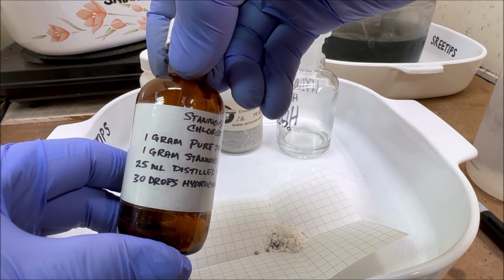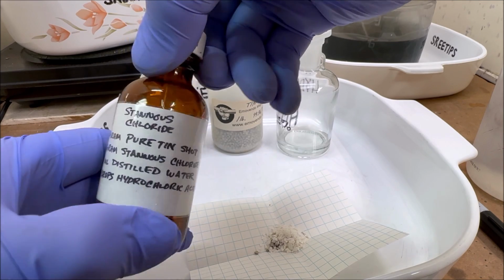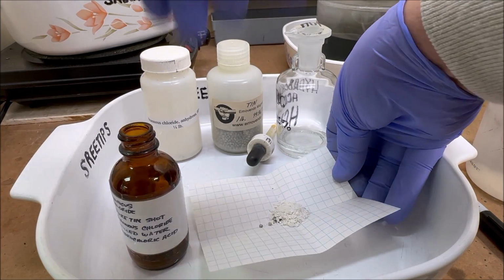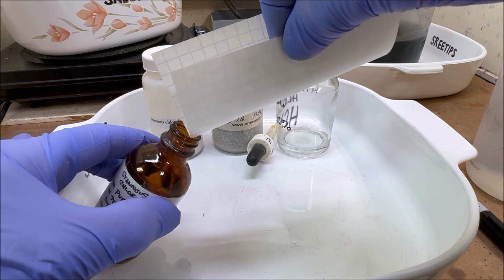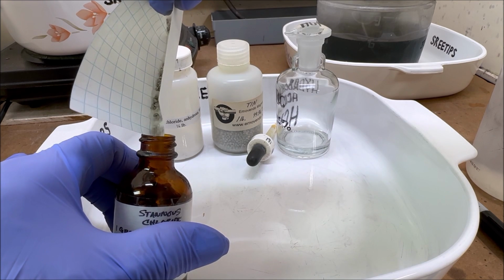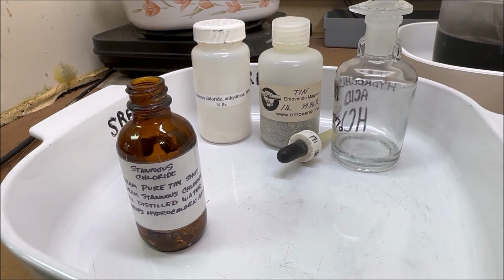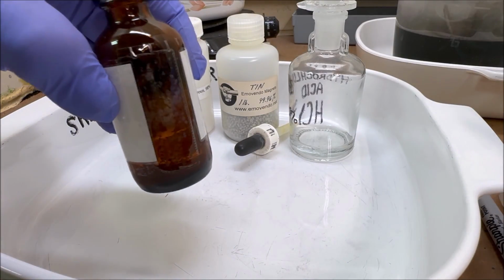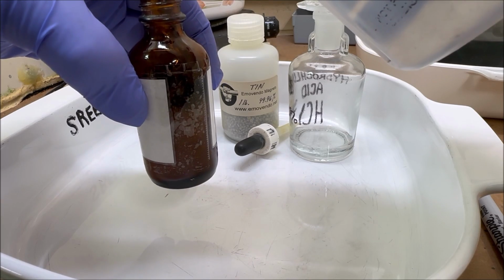Here's the recipe that I'm using to make this stuff. And I'm going to add the material here into this bottle carefully. Next, I want to add some distilled water. The recipe needs 25 milliliters, which is about right here. So I'm just going to add distilled water up to that point.